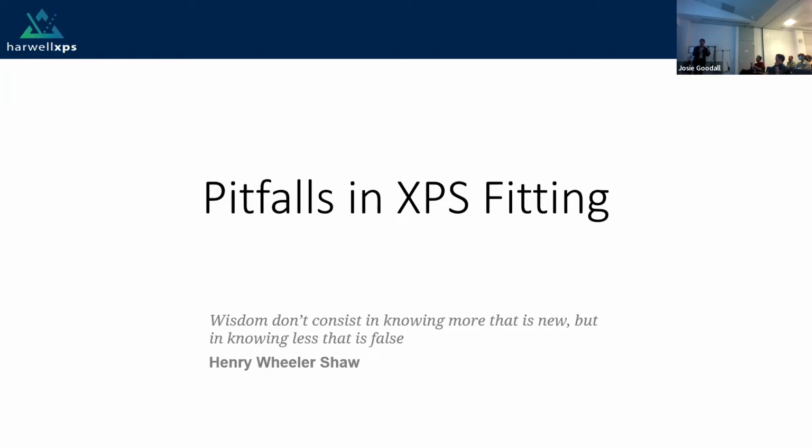There's a recent study, I was going to bring it up at the end, but I think it fits now. The reference will come up on the last slide. A group of XPS experts analysed how well papers in top journals, leading journals in chemistry and materials chemistry, have done the job of fitting XPS data. Their results are actually quite shocking. They found that for unfitted data, when data was presented without any fitting, there was quite a small number of what they call fatal errors.